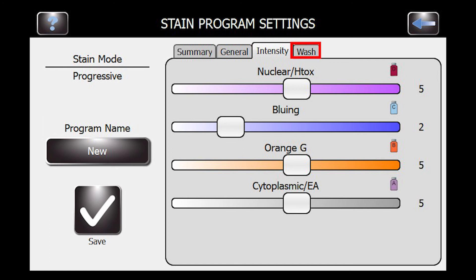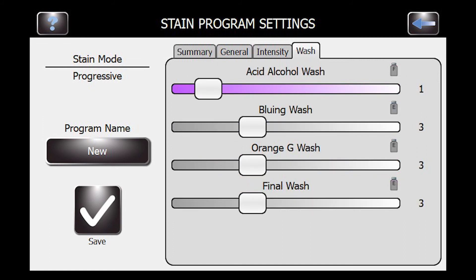Let's go ahead and go to the wash tab. For each stain, there's a wash that happens after it, and the wash will work with the stain. You can turn the wash up and that will decrease intensity and wash the stain away for each of those.